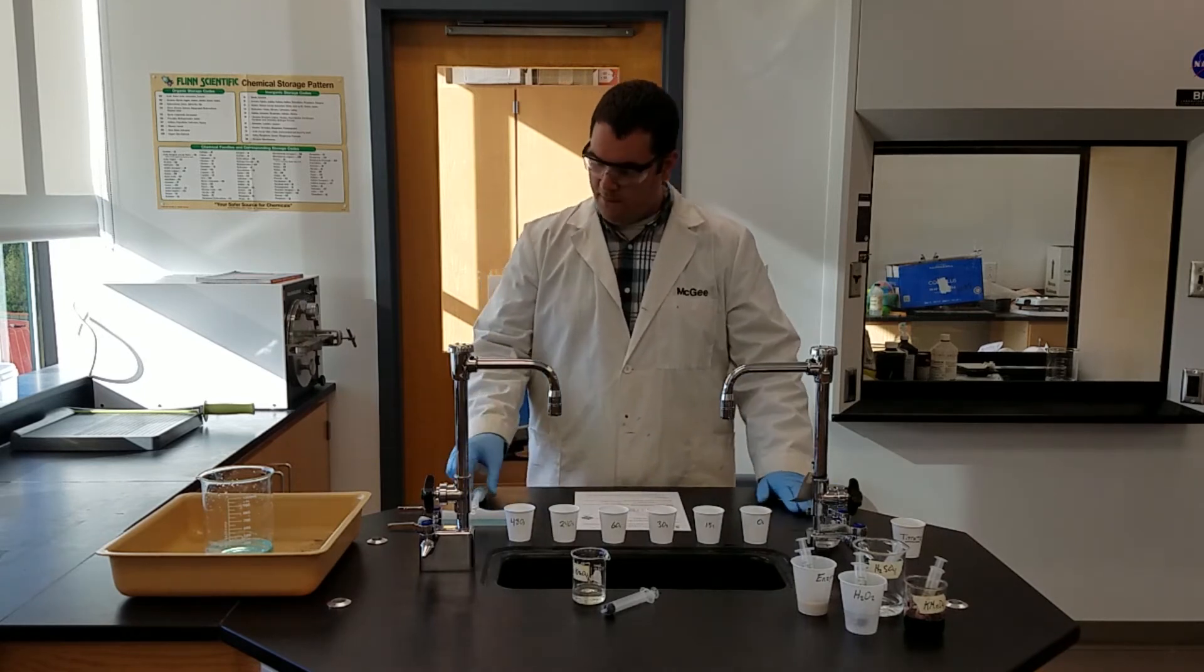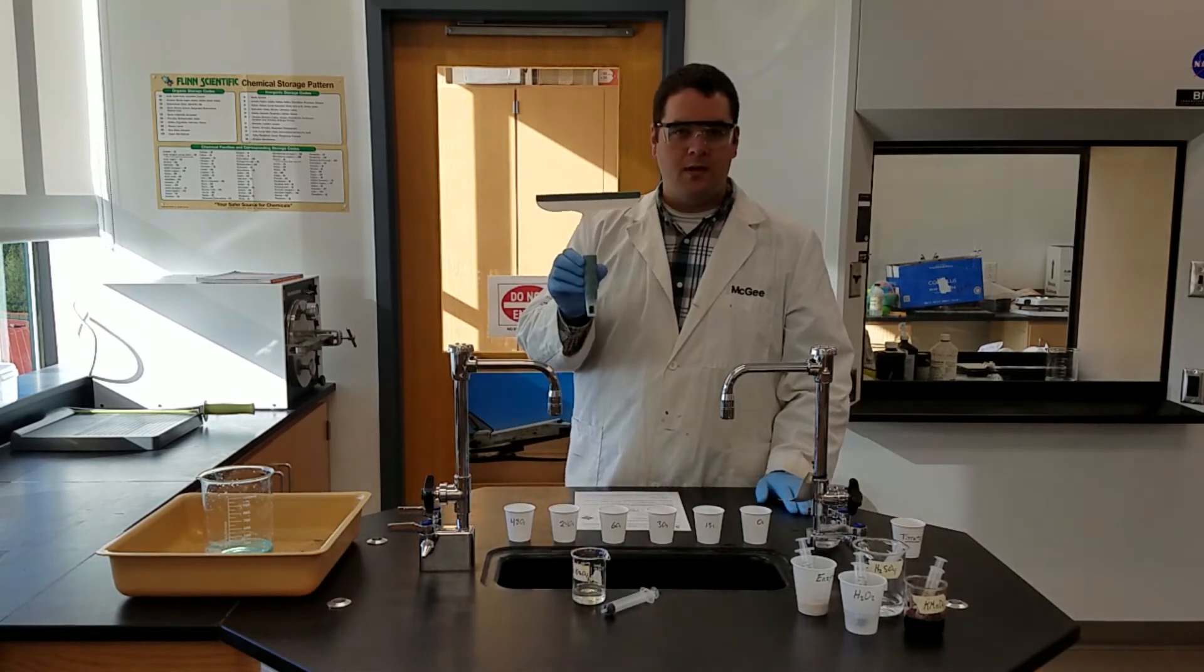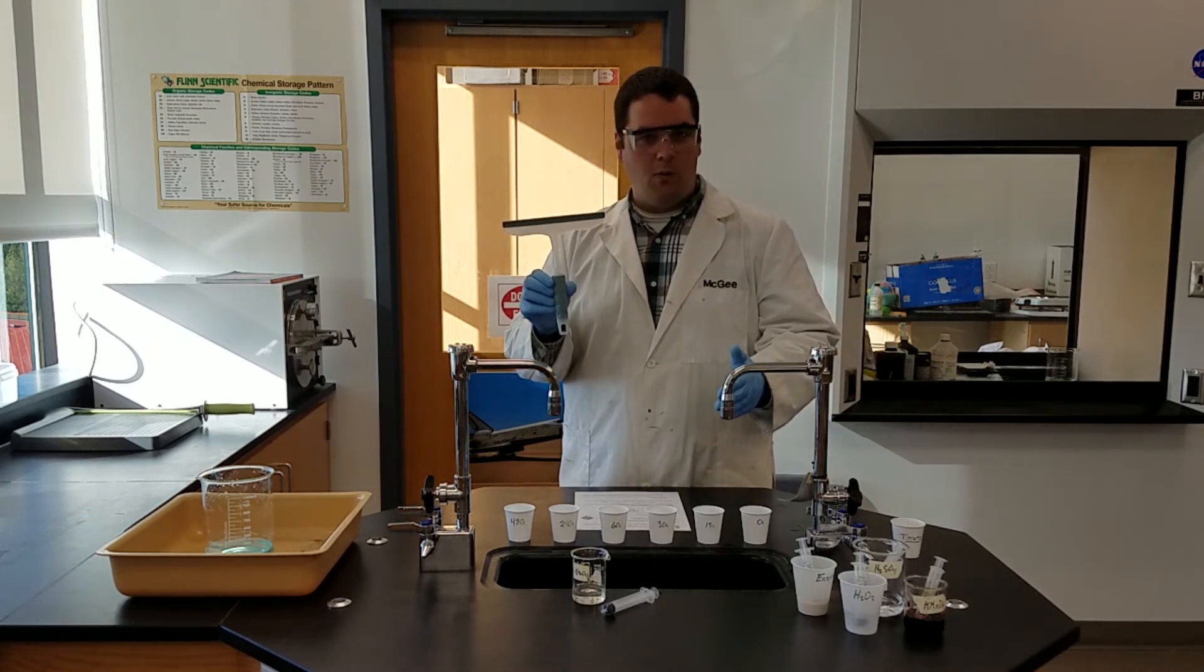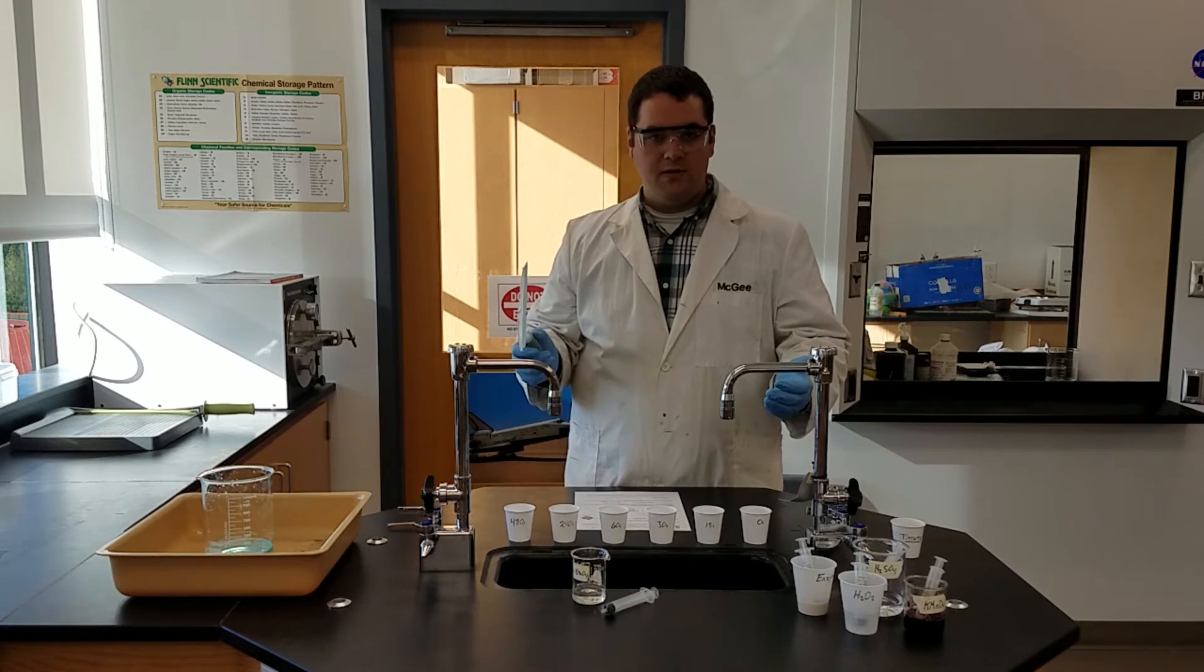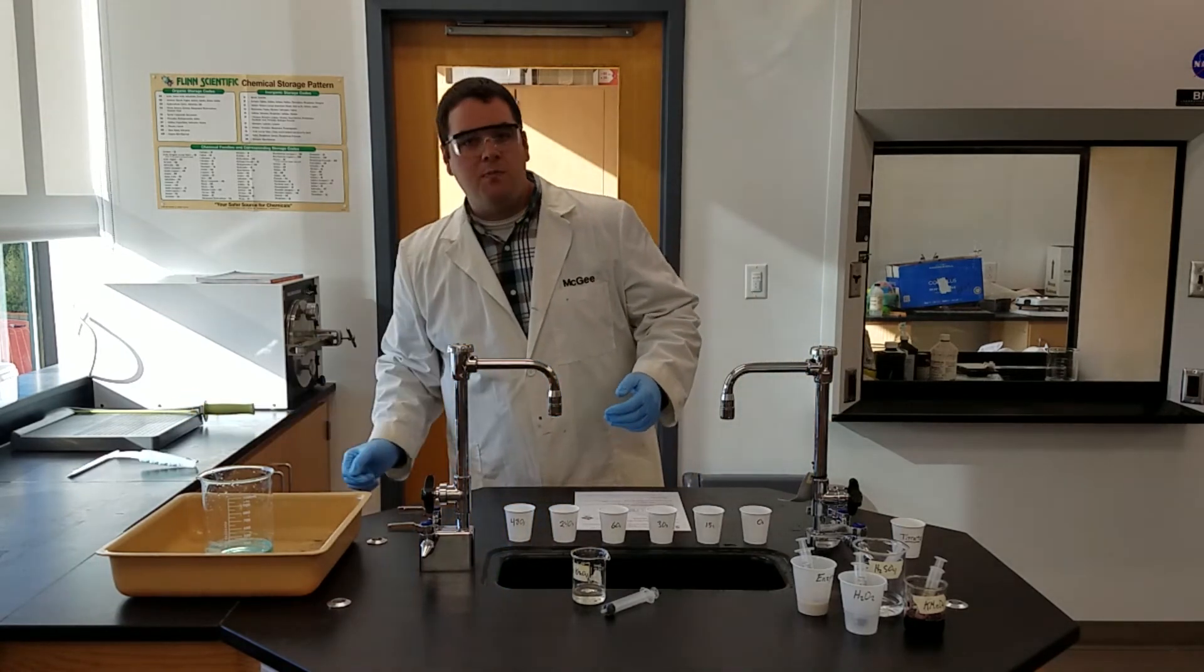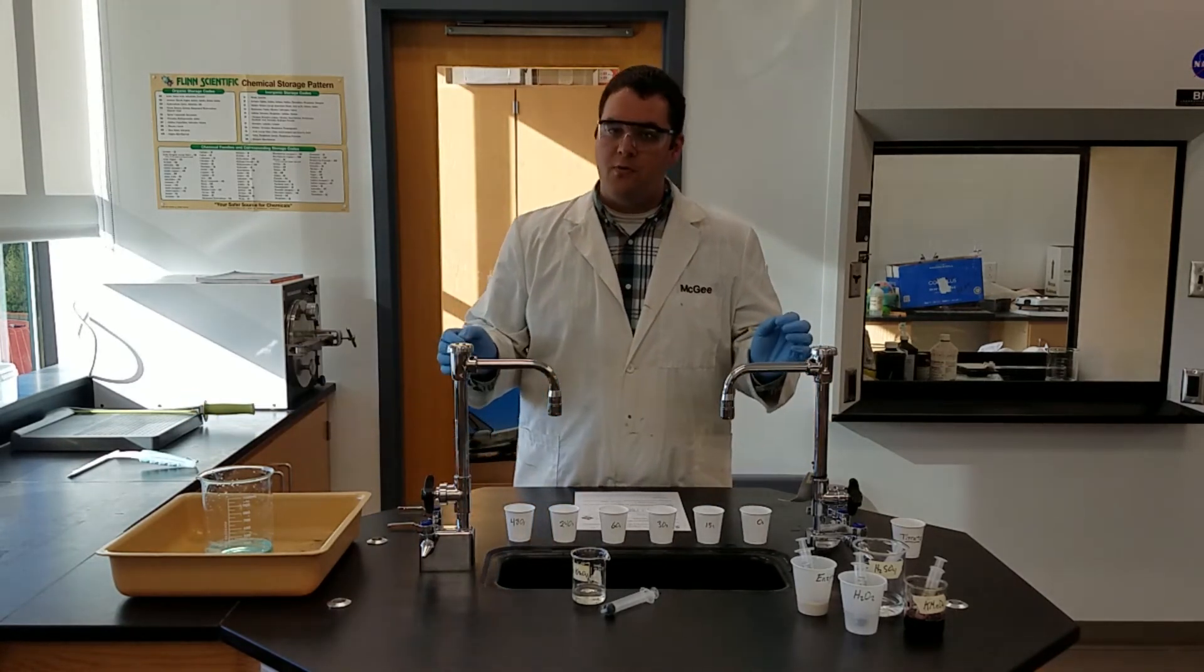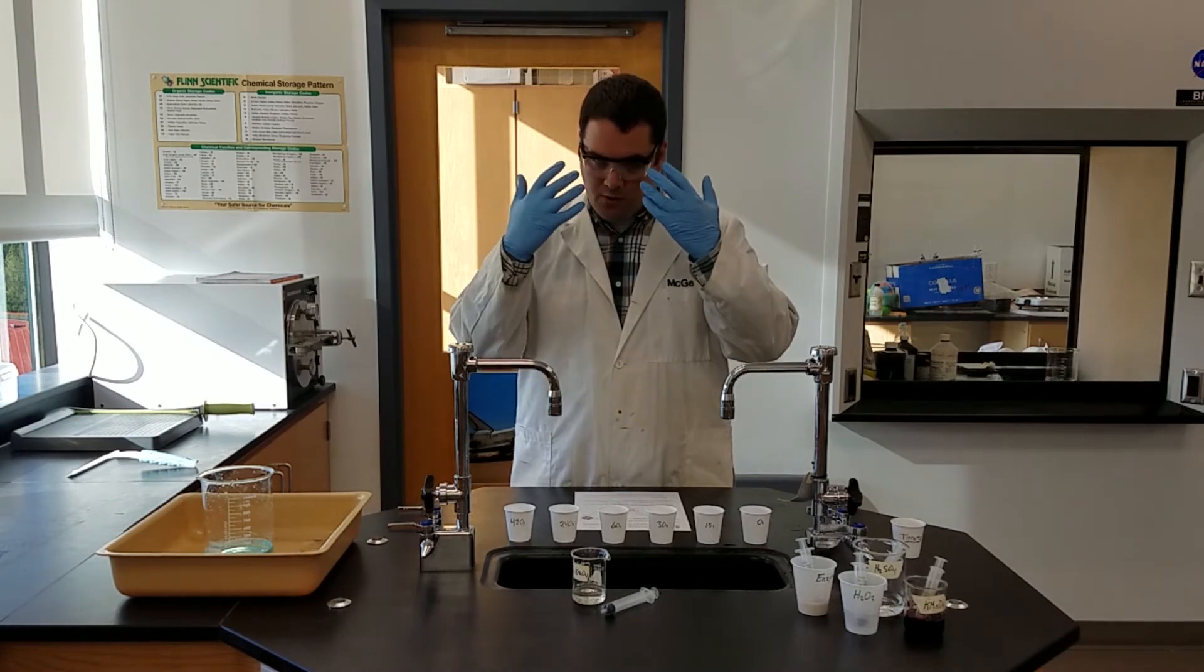Any chemicals on the counter, wipe them off. I do have these little squeegee things lying around the room and you can feel free to grab these. They work really well at squeegeeing up the counter when there's a little mess. But remember, safety is paramount at all times. Please make sure that you don't touch your clothes, especially your eyes.